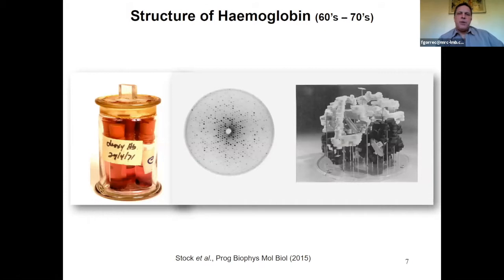It's back here because, when you see the diffraction pattern, it's to say that this crystal still diffracts today. Well, we didn't check recently, but Jan checked that, I think, 10 years ago, and it still diffracts very well. So they're very stable as well. So the stability of crystals was not such an issue before. And we didn't have nice pictures on the computer with a three-dimensional structure, but there were some models made with wooden parts and wires. I think this one was made by Rossmann at the LMB, actually.